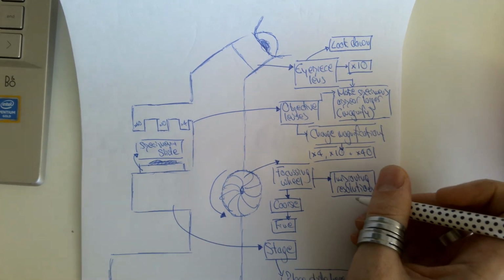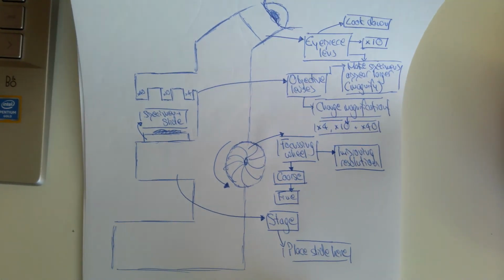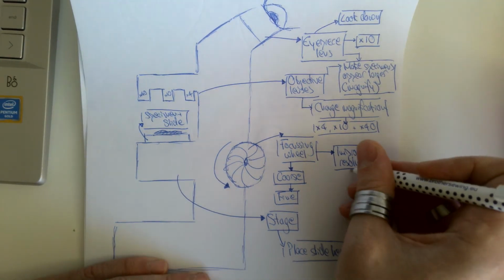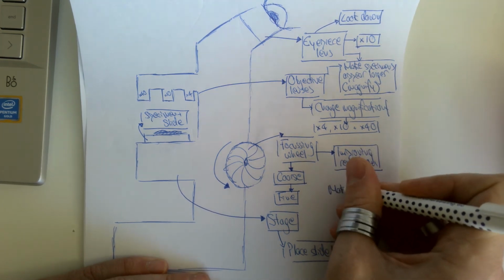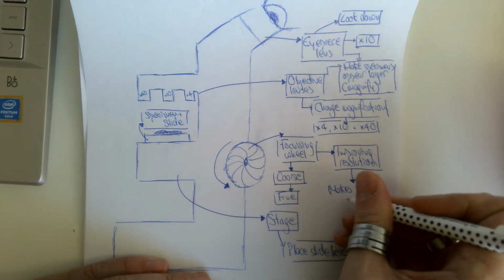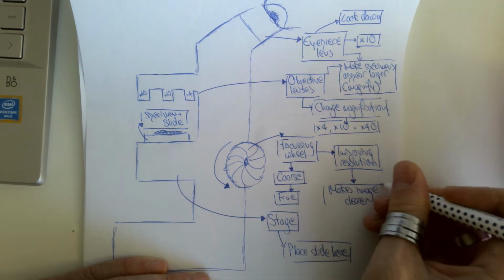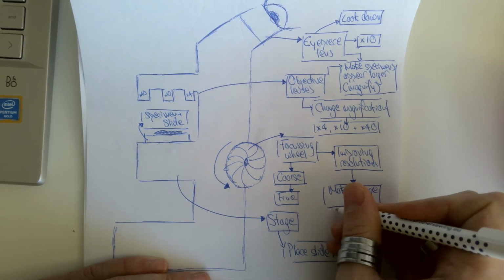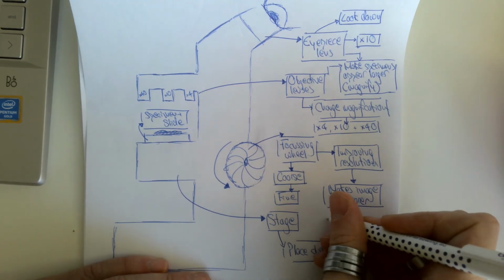So in more simplistic terminology, that means you are able to get and see a clearer image. It makes the image clearer, and as a result of that, the person who's using the microscope is able to see more detail.